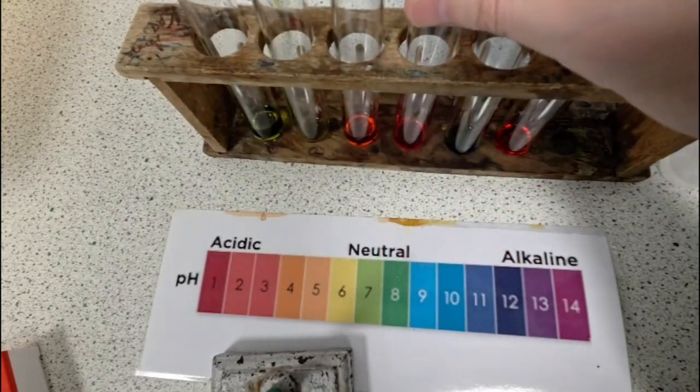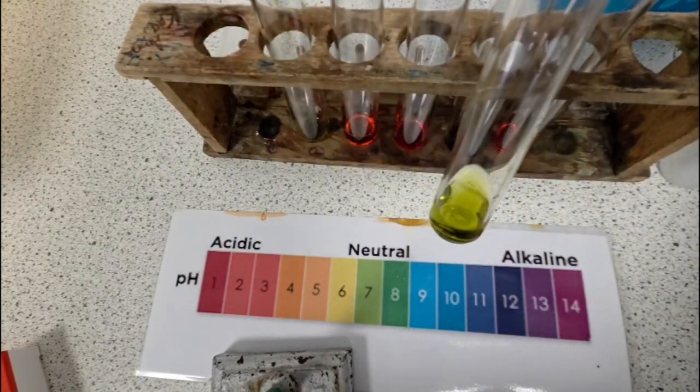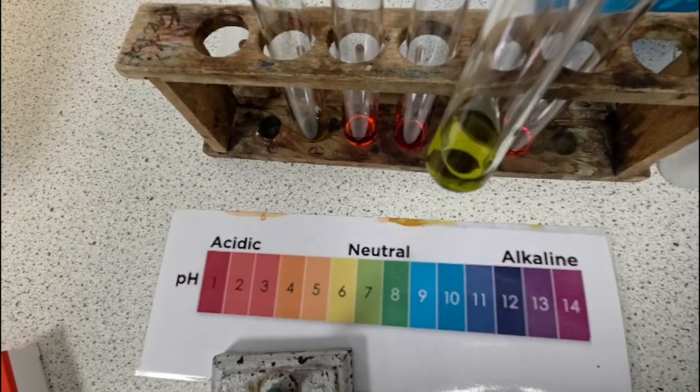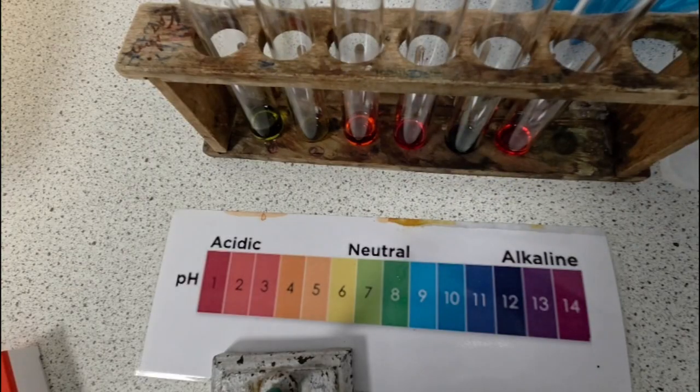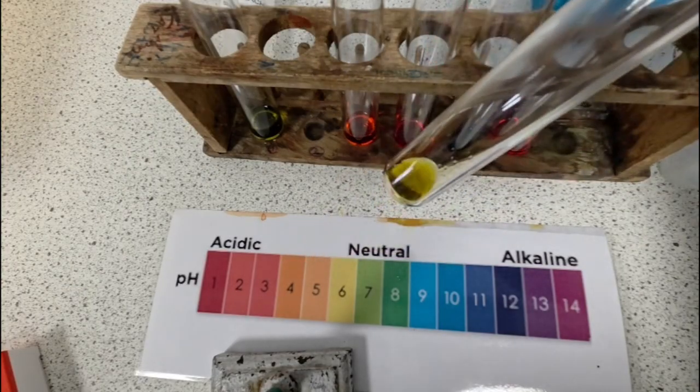It could cause harm. But also we'd see, well, this chemical here, that's neutral. Now, on your skin, it's probably not going to harm you. Still wouldn't drink it. Doesn't mean it's not poisonous. And similarly here, we've got a very weak acid. This one going on your skin, probably not going to harm you.